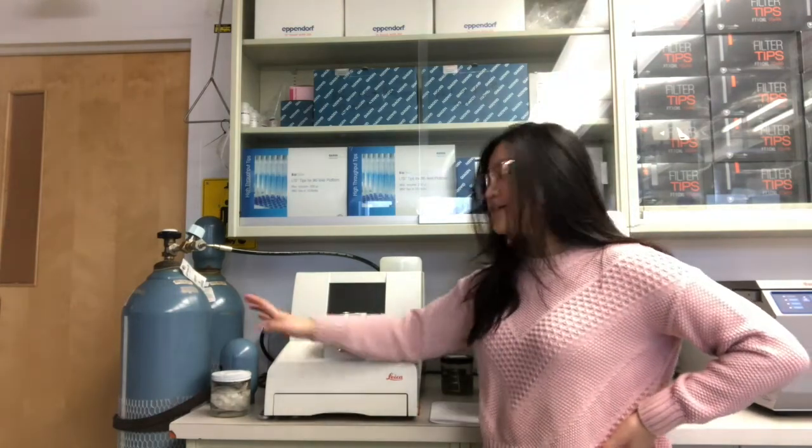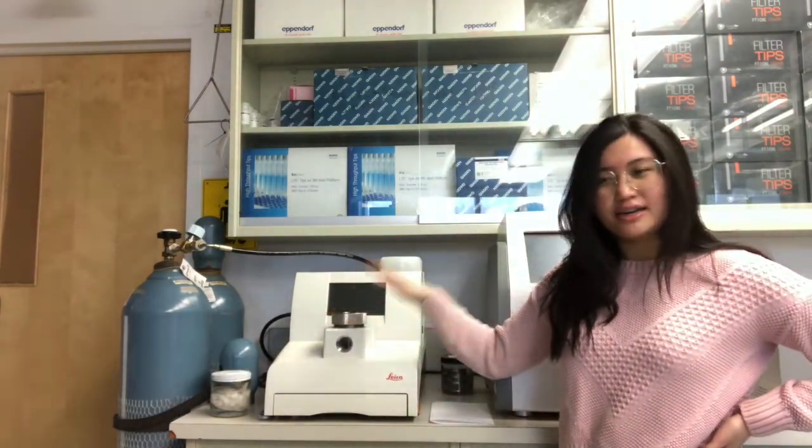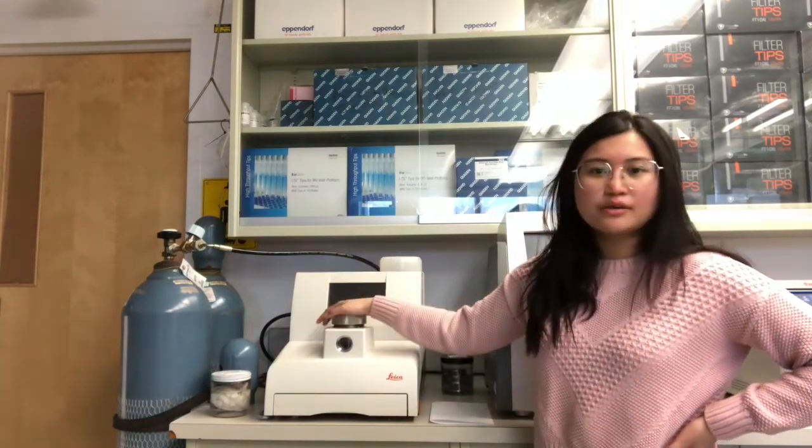Now that your specimens have been soaking in their second soak of 100% alcohol, they are ready to be CPD-ed. This is our CPD machine, and we also have two CO2 tanks on hand at all times. The second tank is there so when you run out of CO2 in the first tank you can easily switch to the second and continue the run. If you don't have a second tank that can cause problems - the run will not finish and the specimens inside won't be usable anymore - so always have a second one ready.